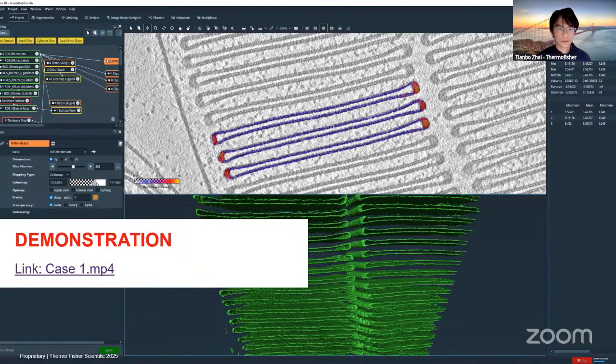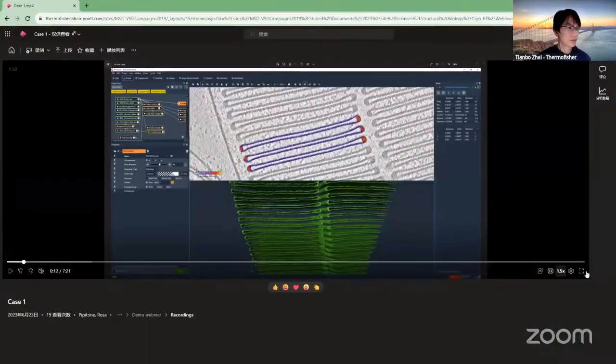So this is a video that I will fast forward, and also along the process, if there are some key points, I will pause. So this is about case number 1 here.